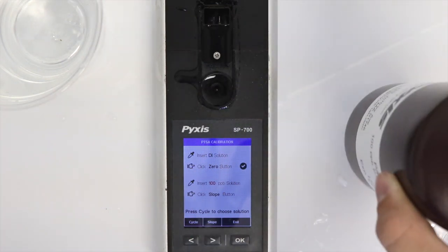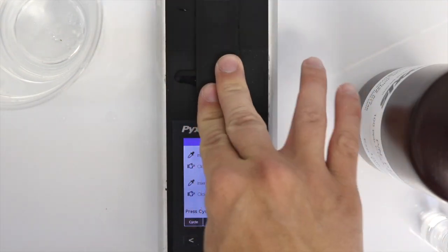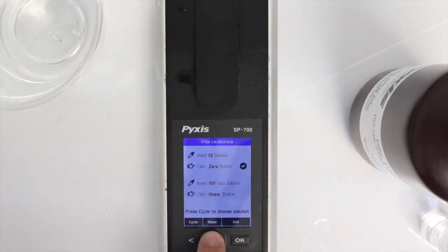Once the solution is applied, close the shield and use the right arrow key to select the slope button. A calibration success message will be displayed.